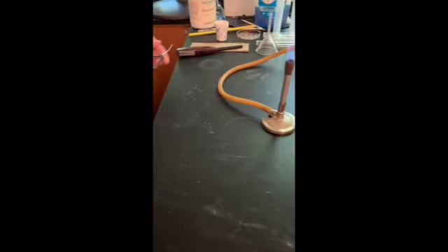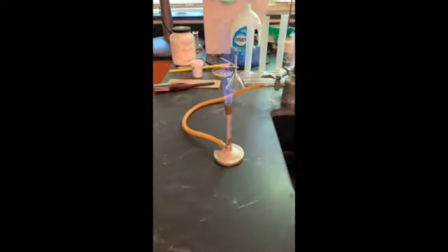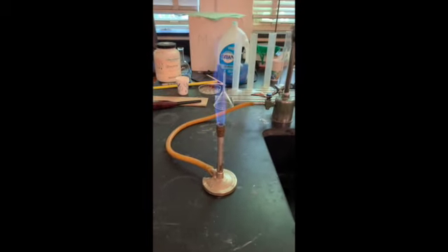All right, so Maurice is going to take a piece of magnesium metal and put it into tongs. The reaction that we're talking about today and the goal of today is to figure out, let's take a close look at that magnesium, the energy involved in the reaction you are about to see. We're going to be reacting magnesium with oxygen. Now we could just wait a very, very long time and let this happen with the oxygen in the air, but instead we are going to burn the magnesium to speed up the reaction. So Maurice, go ahead.